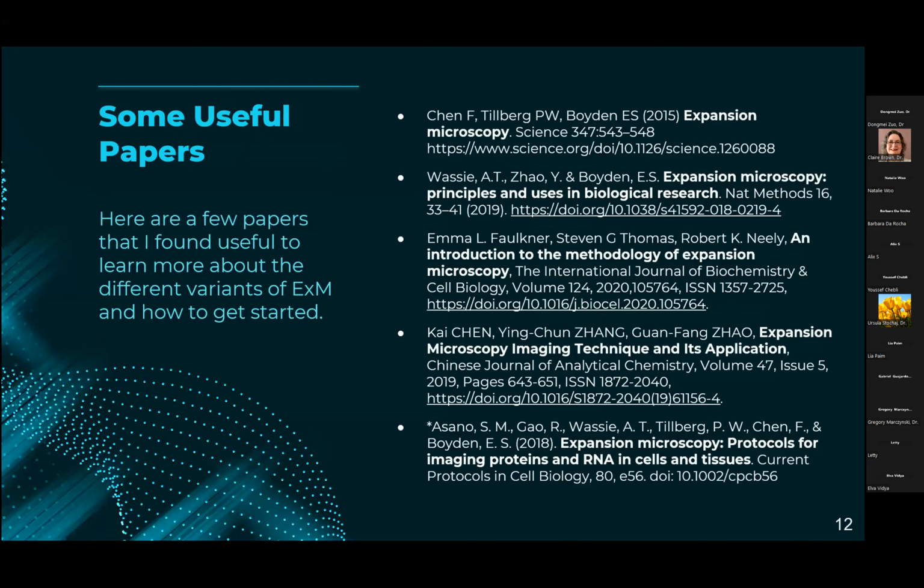And here are just some useful papers that I found to get started. The first 4 teach you a bit more about the different types of expansion microscopy techniques out there, and they do a very thorough job of describing what is good for each one. The last one here is protocols. I followed this protocol my first time and it worked. I would say it's pretty good. I haven't done cells, I only did brain tissue, but I was pretty happy with the results.